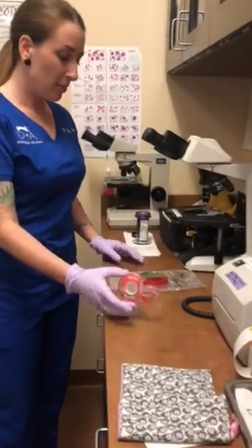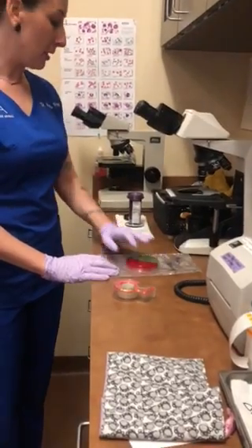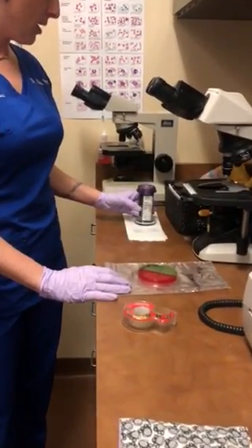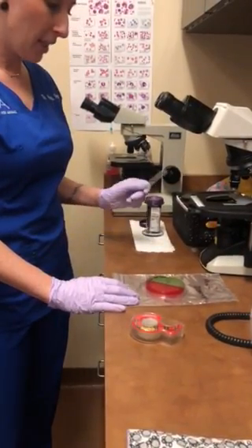So the first thing you need is scotch tape. You're going to need your colony plate, and you're going to need the third stain of your Diff-Quik, which is a methylene blue based stain, and you're also going to need a slide.